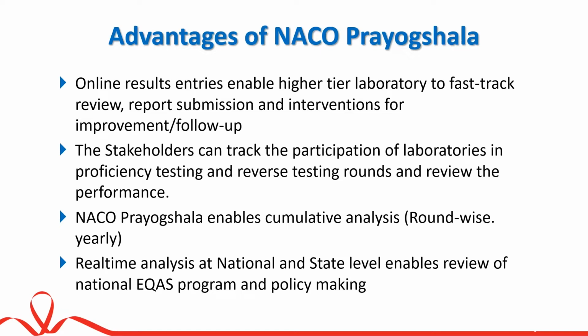This is also helpful in cumulative analysis of the e-LaQSH rounds, which may be round wise or yearly, and past year data will be available with a click, so that performance can be analyzed and compared among the months, round wise, and along with the past years.